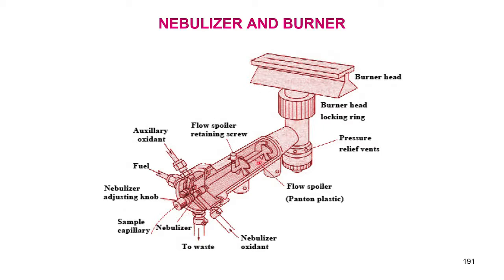For this, there is a waste outlet in the nebulizer design itself, that I have not shown you, but I will show you now. See, there is a waste here. So, whatever liquid is not converted into spray gets collected here and goes to waste. So, you need to keep a bottle to collect the waste and discard it at the time of analysis.